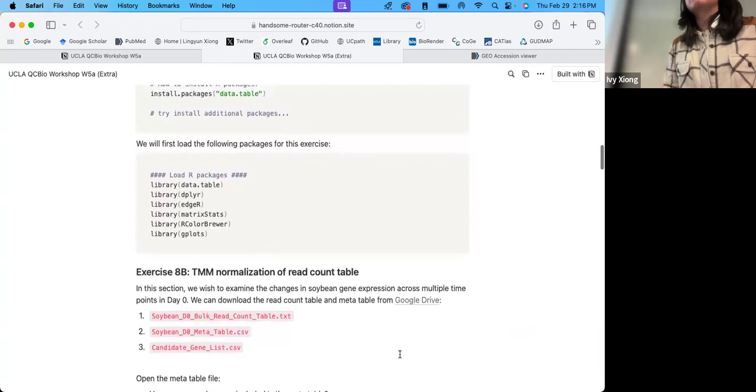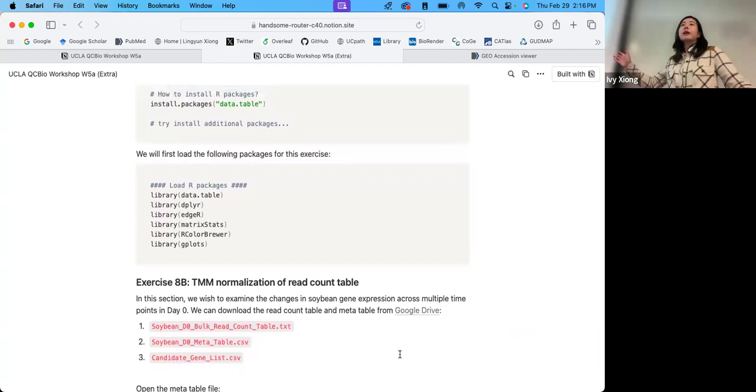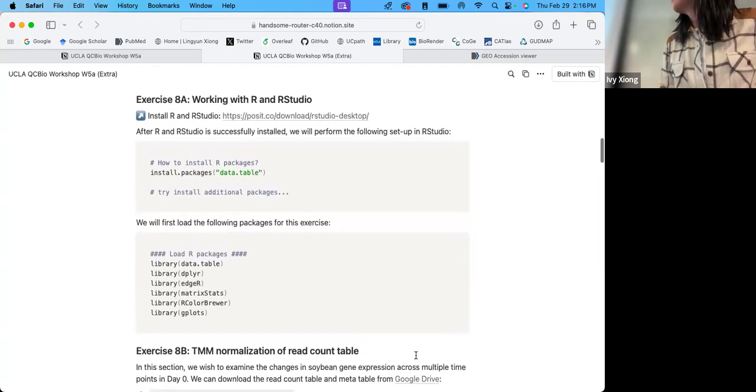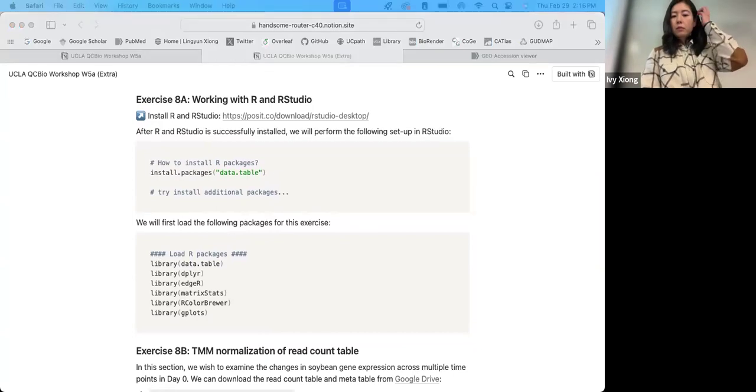This is basically right after all of this stuff. For example, yesterday we went to the count table. You would have downloaded the spreadsheet to your laptop, and now we do everything in RStudio. We don't need Hoffman, it's local. Yeah, that's right. Okay, so let's give it a try. If you are still downloading, you can put it aside, but you do need to open RStudio on your laptop now. That's going to be the main focus for the remainder of the workshop.